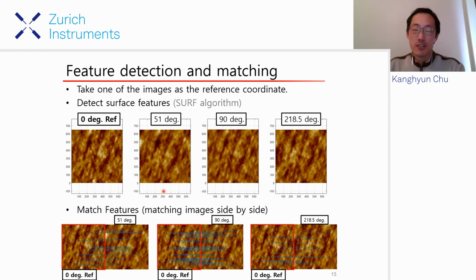the coordinate conversion maps. When I was doing my PhD, I was not familiar with this kind of surface image processing. So I had to pick the points one by one by hand and by eye. That is quite a hard and tedious job.